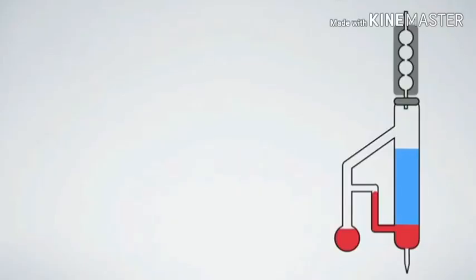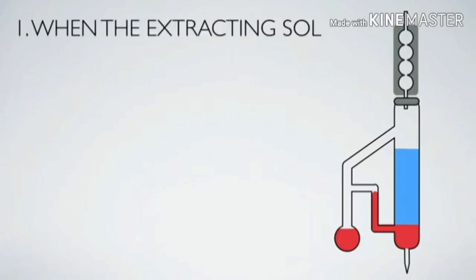This video will show two common versions of liquid-liquid extraction. The first one is by using heavier than water solvent, and the second one is lighter than water solvent.